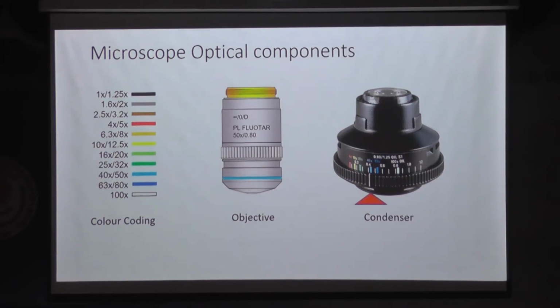While I am seeing in the microscope, I need to make sure that while I am using this objective, I turn my condenser to this level. Only then the numerical aperture of the condenser and the numerical aperture of the objective are balanced. The three contrasts I showed earlier are balanced with the help of this knob.